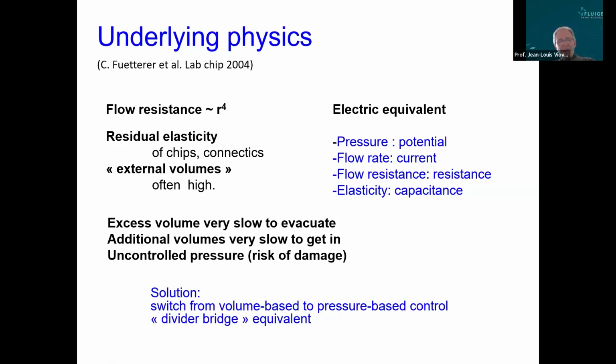And beside this, you have external volumes, like the volume of the tubing, volume of the reservoir, and so on, which are often high as compared to the volume of the microchannel itself. So this combination of residual elasticity and external volume has an equivalent in electricity, which would be capacitance. And if you have an electric circuit which has a high capacitance and high resistance, you have a system which has a very high time constant.